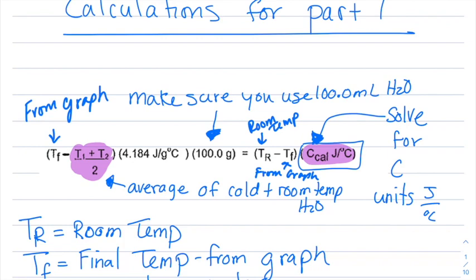But now you don't have to worry about that. Dr. Perot very expertly poured that acid. That was quite a feat, to pour from a large bottle into a graduated cylinder and hit the right mark at the same time. So here you have 100 grams because you used 100 milliliters of water.